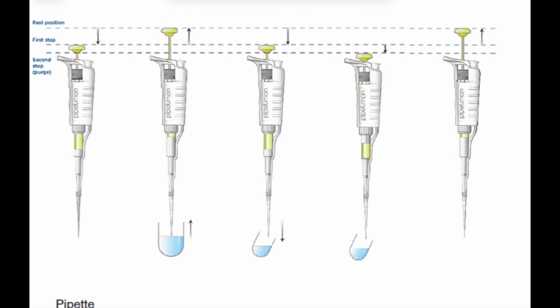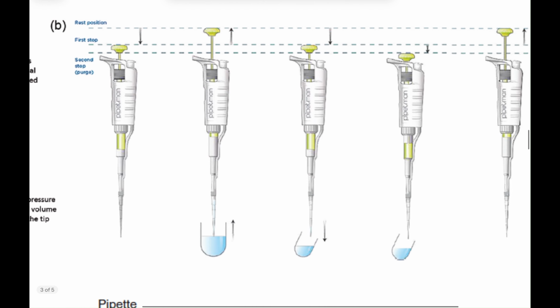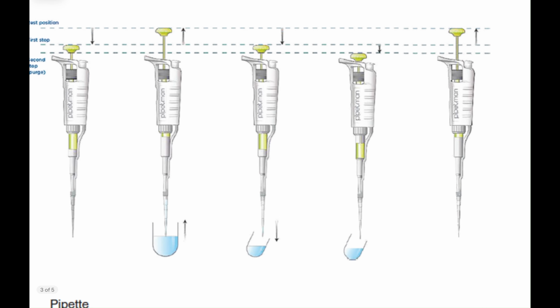and you do this by rotating the knobs at the top of the pipette. Let me just use my laser pointer. You're going to rotate that to your desired volume. You never want to rotate beyond the upper or lower limit of the pipette's range, because that can damage the internal mechanism. And then you want to make sure that you attach your disposable tip. You press it firmly down into the shaft to create this airtight seal. A poorly fitted pipette tip is going to be one of the most common sources of pipetting error.